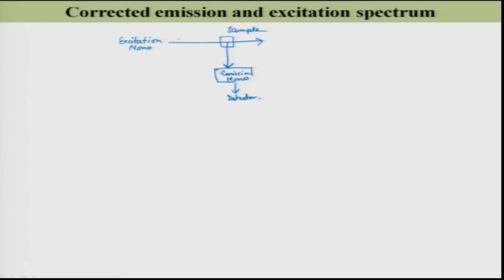As I said, you already have a reference channel over here. This is my reference detector. I named this detector S1 and the reference R1, the simplified version of that complicated fluorimeter.